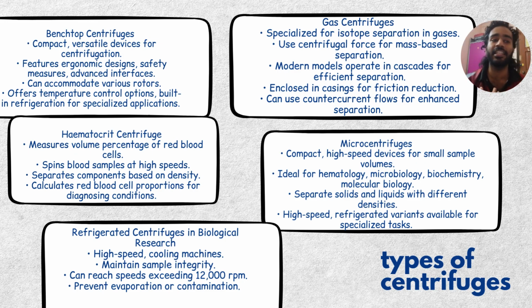Firstly, let's see the benchtop centrifuges. These centrifuges are compact and versatile designs for centrifugation, featuring an ergonomic design with safety measures and advanced interfaces. They can accommodate various rotors, and they offer temperature control options, built-in refrigeration, and specialized applications.